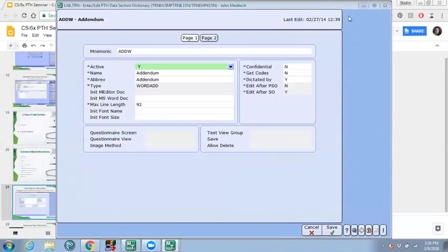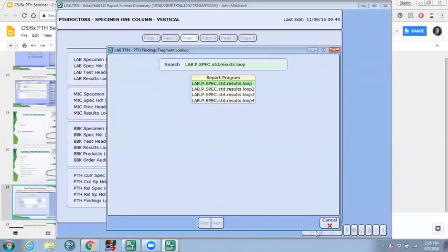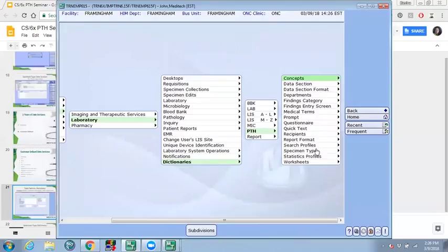which is the specimen type dictionary. The pathway to go to that dictionary will be similar to the pathology one, and we have the specimen type.